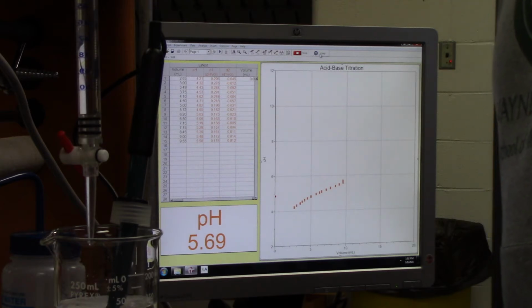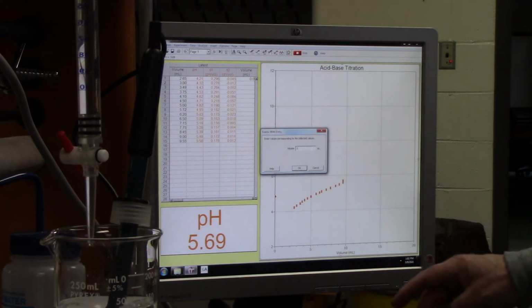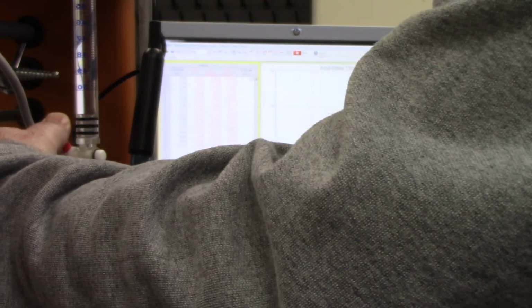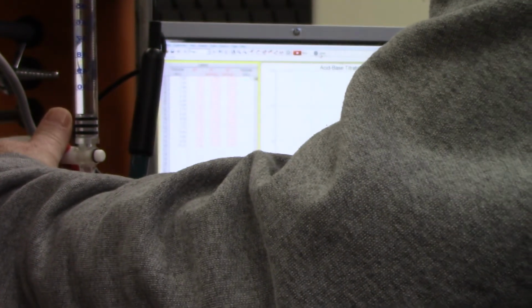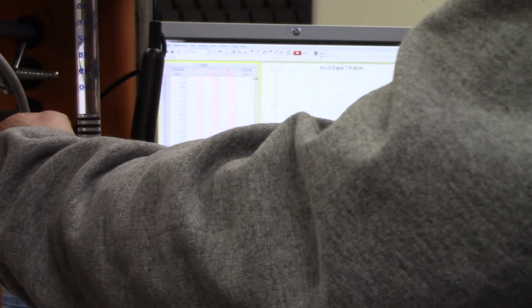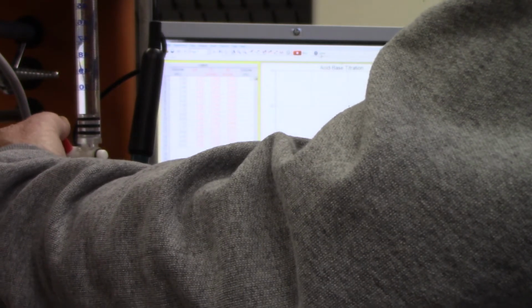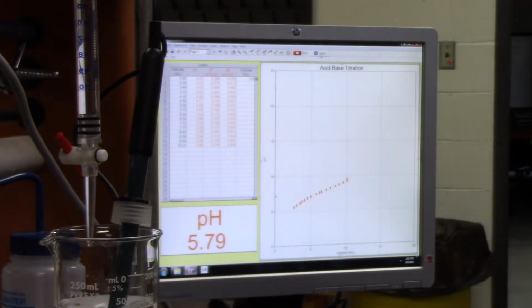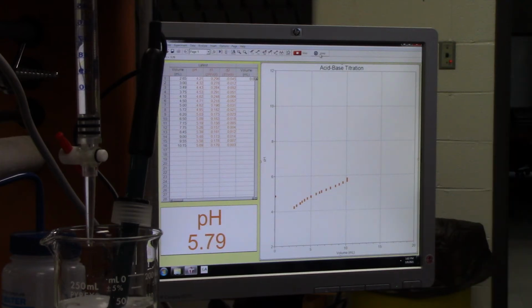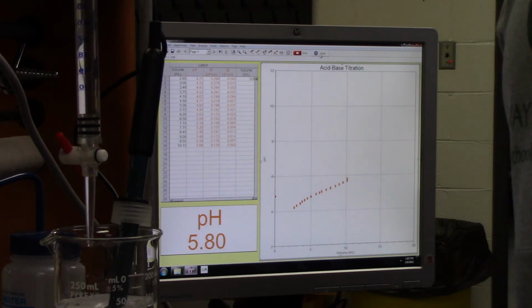All right, 10.15. Okay, go up to 579. 10.7.